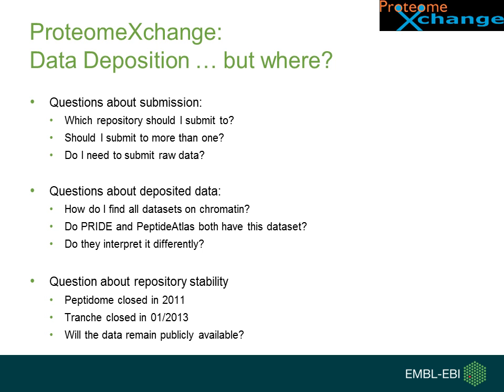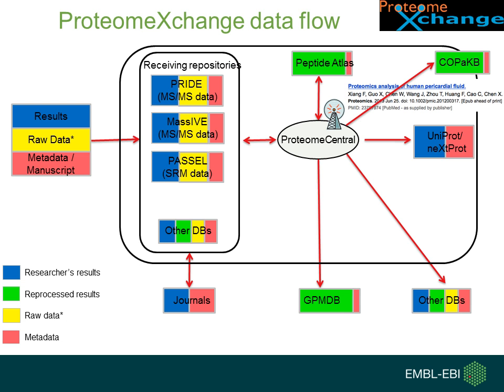And this is the high-level overview of how ProteomeXchange works. It is a federated repository. We are not replicating data between different sites. The data is only kept at one site. Only the metadata is centralized.